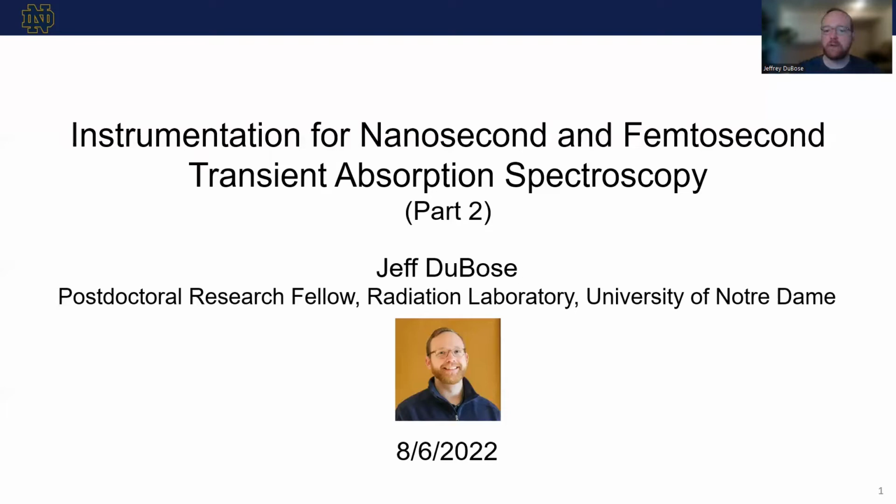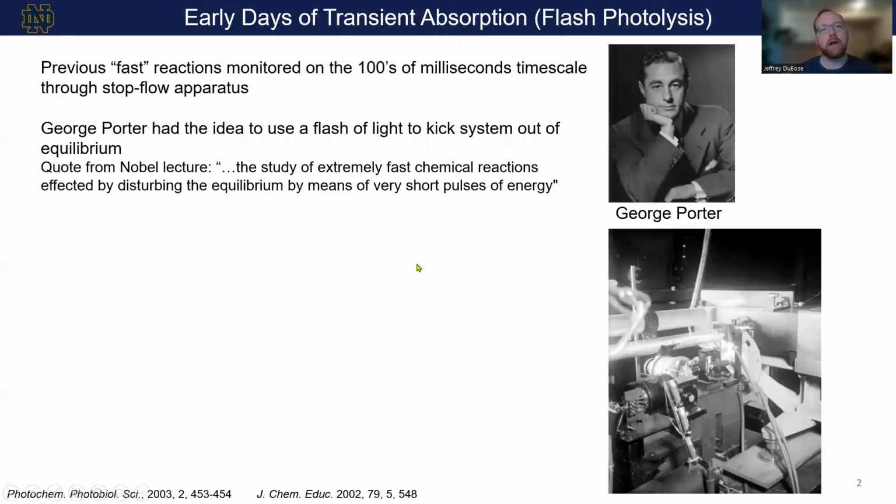So to start with a little bit of a historical look, you know, the early days of transient absorption spectroscopy, also sometimes called flash photolysis, previously a fast chemical reaction was monitored on the hundreds of milliseconds timescale using typically stop flow apparatus, right? You have two different liquid streams that then come together and mix, and you look at the changes and basically properties from there.